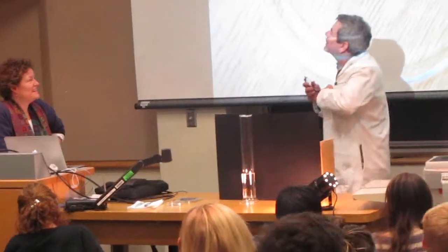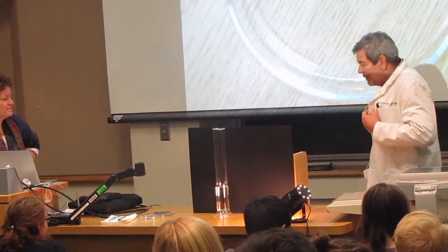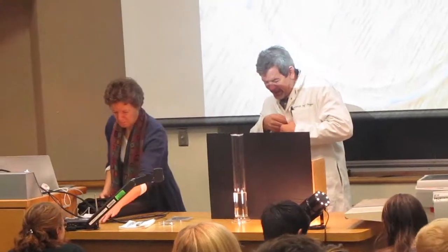We're going to compare the properties of lithium, sodium, and potassium, both some physical properties and some chemical properties. So I have them all three here.